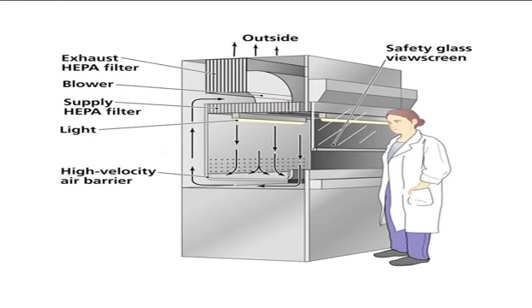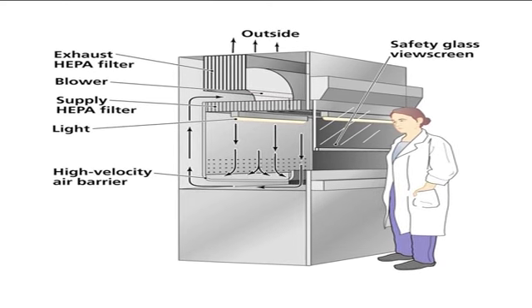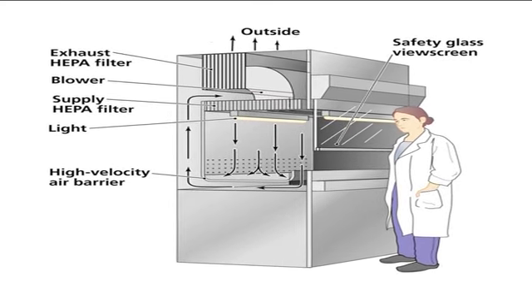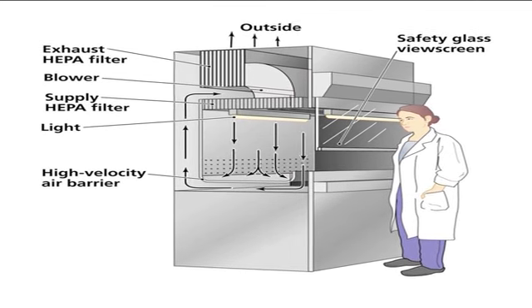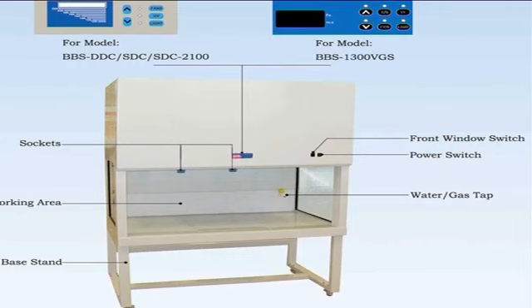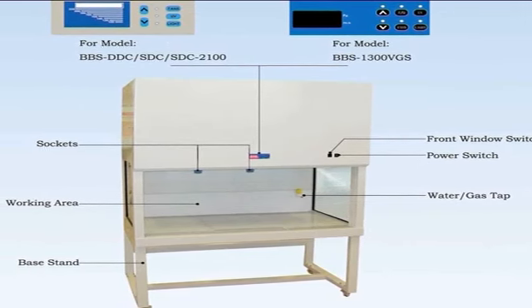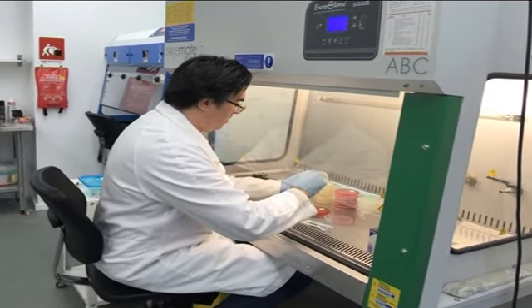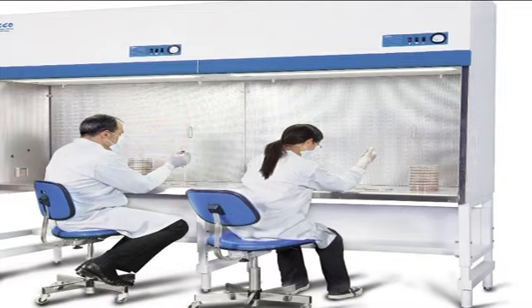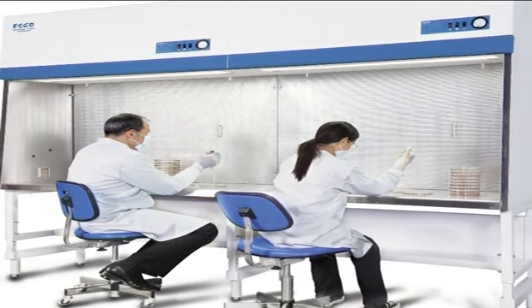Laminar airflow cabinets have been used extensively in laboratory to provide an environment free from microorganisms with excellent and consistent results. In the laboratory, airborne contamination can often influence experimental procedures and results, which is why processes should be carried out under controlled environmental conditions.